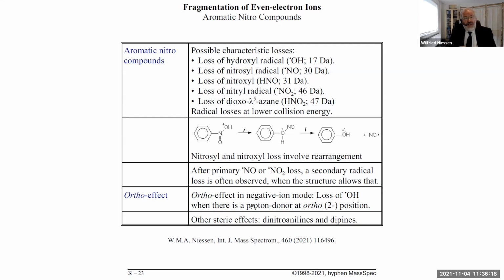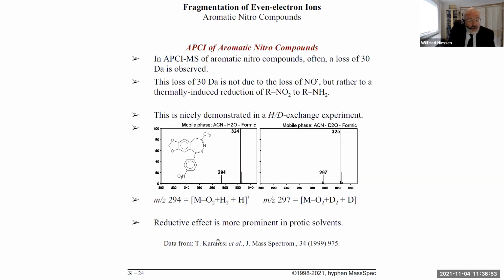And in looking into the fragmentation of a whole range of nitro compounds, which is something which I did last year as part of my keeping on doing science in the Corona lockdown period, I looked into a variety of compounds, and I noticed that there are some other steric effects which you can see, and I will show you an example of that when we proceed. And if you want to read more about that, that's the publication, which is both on halogen and nitro compounds.